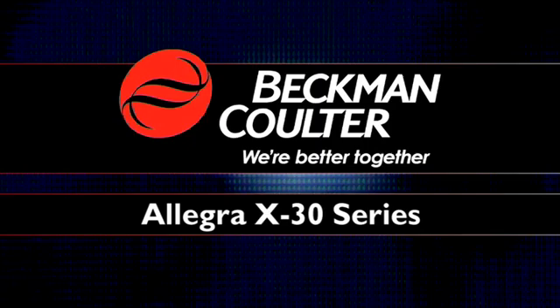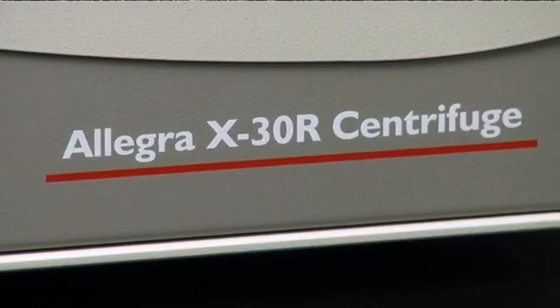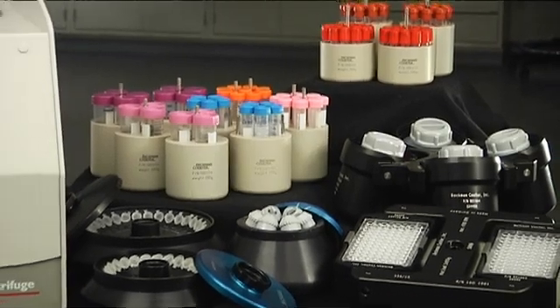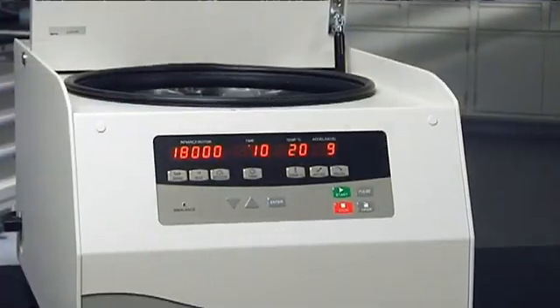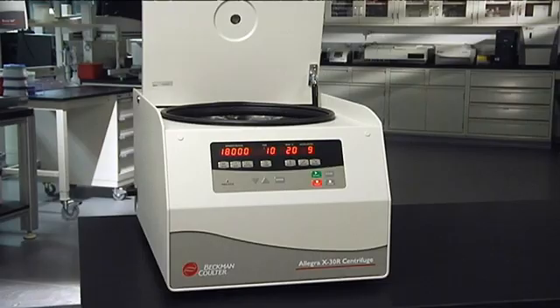The Allegra X30 Series provides excellent performance and easy operation in a compact design that saves you valuable time and laboratory space. The Allegra X30 Series has it all: performance, convenient application packages, easy operation, a compact design — and it all comes with the trusted Beckman Coulter name and service commitment.